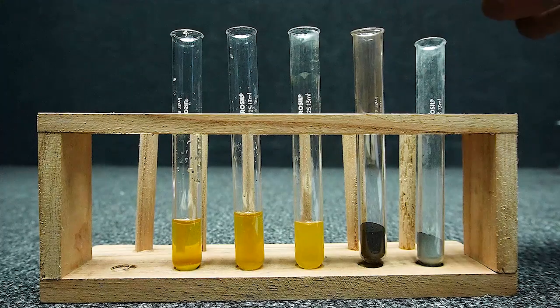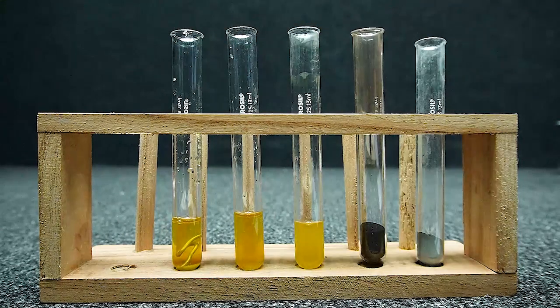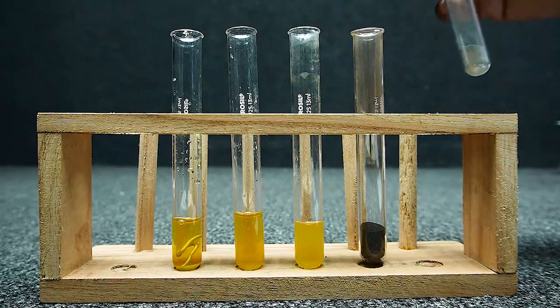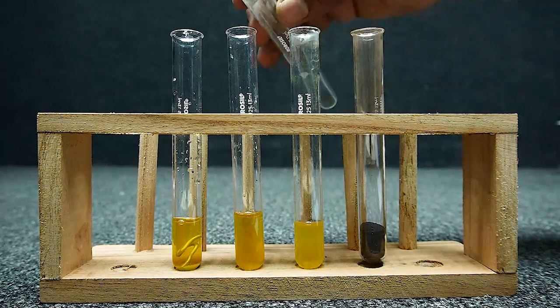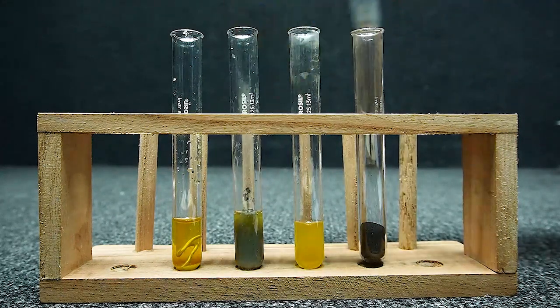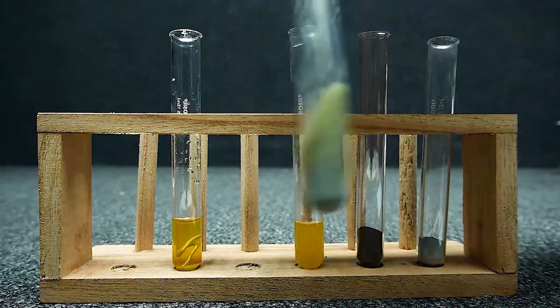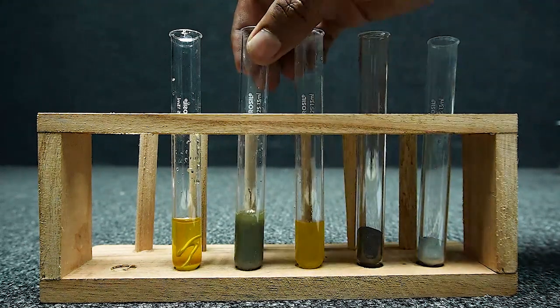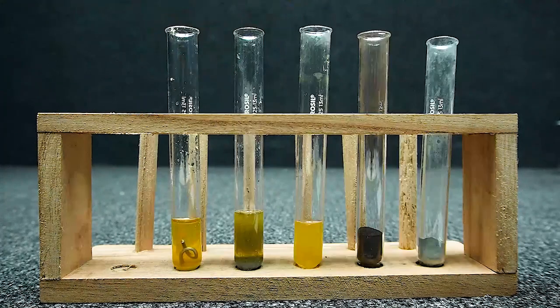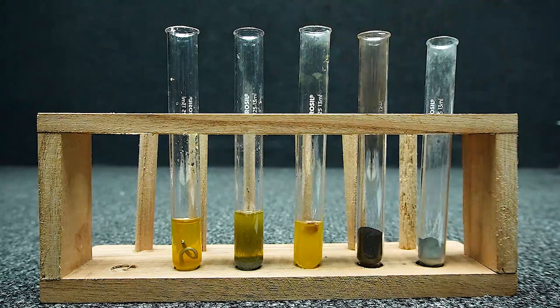Reaction of iron sulfate with aluminium. Reaction of iron sulfate with zinc. Reaction of copper with iron sulfate.